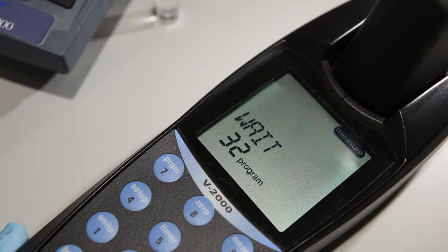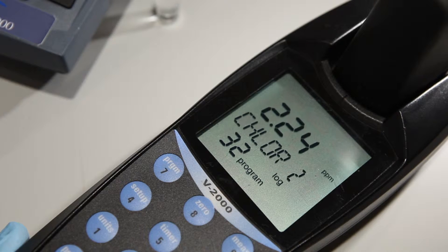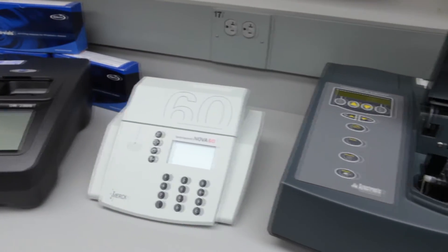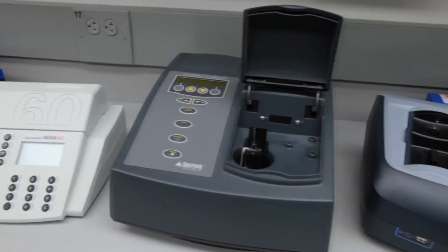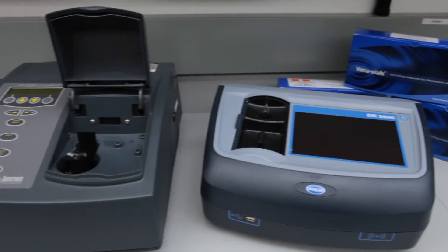Commetrix Vacuvial ampules can be used in other manufacturers' instruments as well. As long as the spectrophotometer is capable of accepting a 13mm round cell, it can be set.